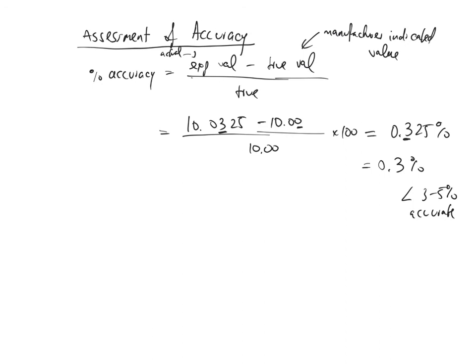Make sure you can do any of these calculations without taking a look at your Canvas page or your lab notebook pages. You should be very proficient calculating statistics and percent error from given data using your graphing calculator or Excel. I hope this helped, and good luck in the experiment.